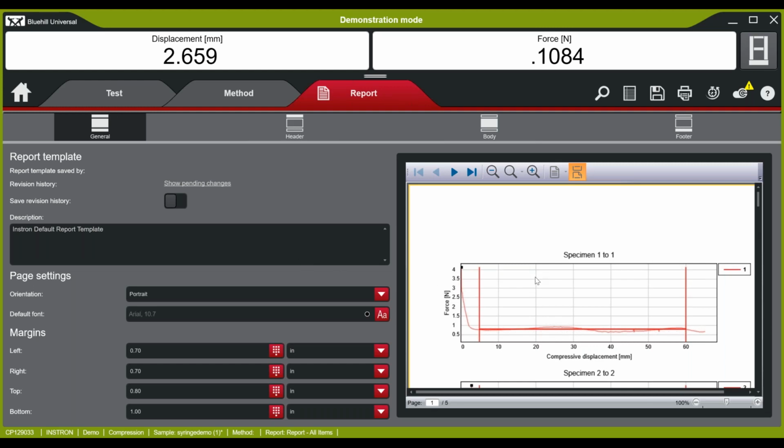So the next question, how does the system calculate transverse strain? There are a couple different ways, but you would need some sort of transverse extensometer. The options would be a transverse clip-on, a biaxial clip-on, which could do both axial and transverse measurements, or the AVE, which is the advanced video extensometer, has a transverse option, which could measure 2 dots placed along the width of a specimen.